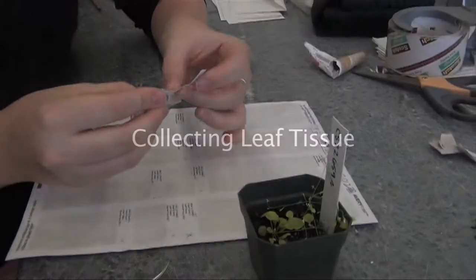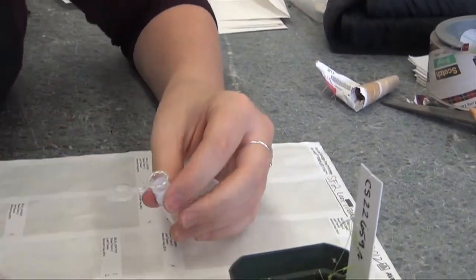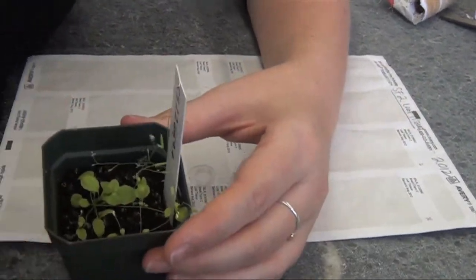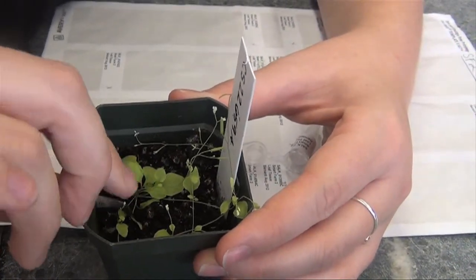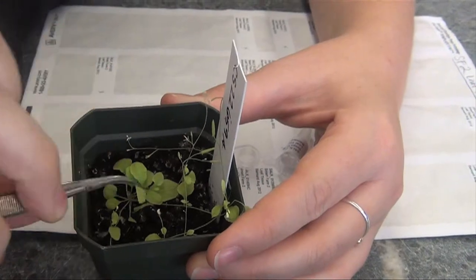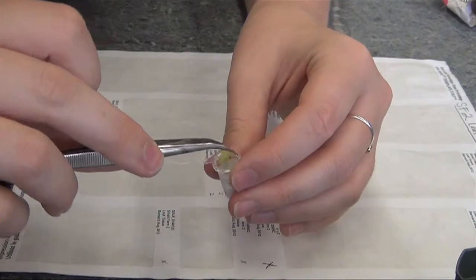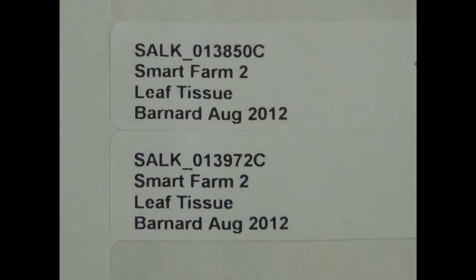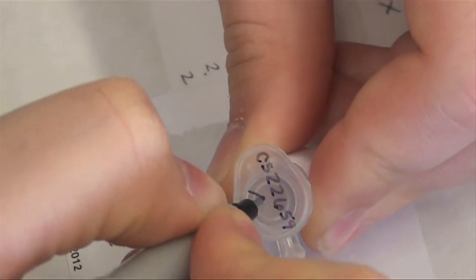Our farms are also used to generate tissue for genotyping. After the plants have bolted, but before they become brown and crispy, you will take one leaf from the rosette and put it in a labeled tube to be sent to one of the labs responsible for genotyping. The label should have the line number, the name of the farm, the location, and the date. You can also add the line number with a sharpie to the top of the tube for easy reference.